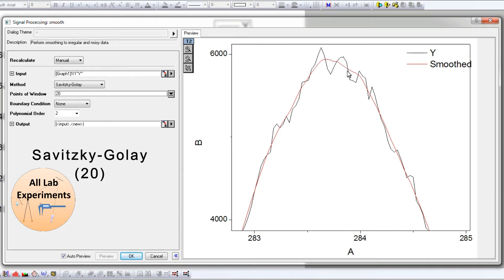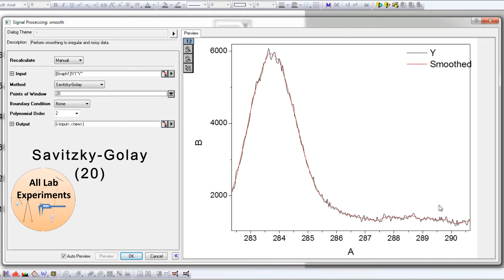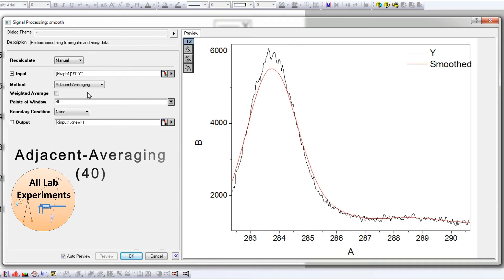If we check Savitzky-Golay, we will find that now this is getting much smoother than earlier, and the peak height is almost the same. Similarly, the second part is also smooth. Now if I increase this to 40, what will happen?